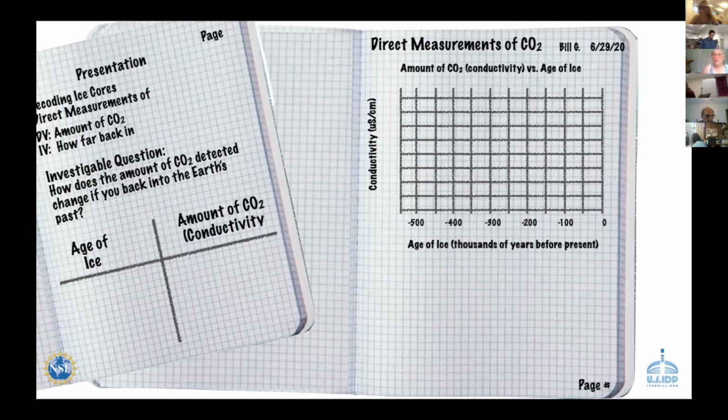Over time, you can see the carbon dioxide leaving that water. So that would make sense that yours is 58 and mine is only 5. I set mine up a few days ago, and I've lost carbon dioxide out of my water. The last one has a reading of over 55 because I measured mine the first time, and it was close to 58, 60.